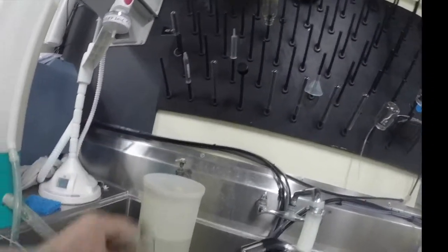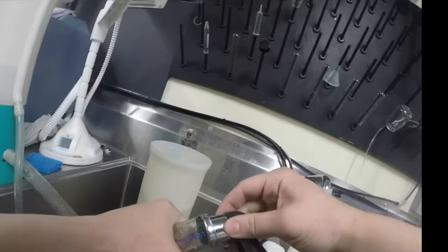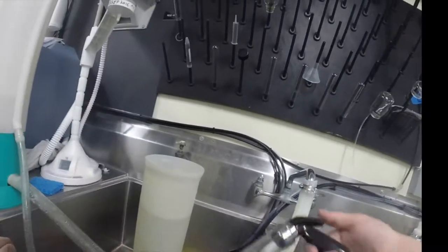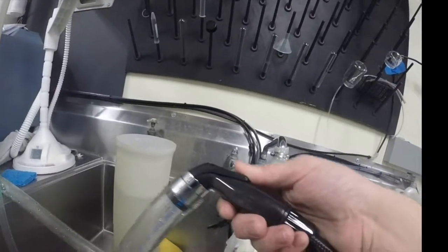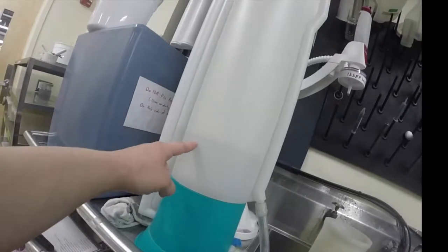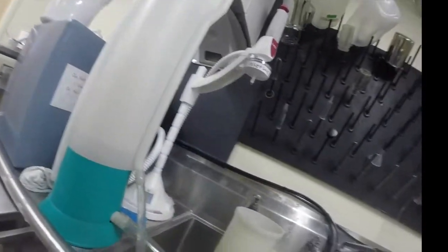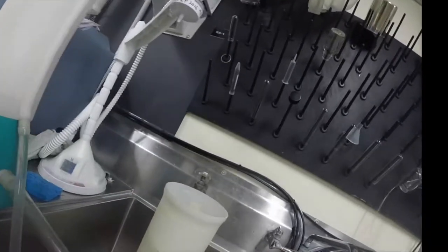So what I'm going to do, as it turns out, this guy fits pretty snugly to this. So if I just put it on there pretty snug and just apply pressure to it, the same thing is going to happen, right? We're going to be rinsing it through. Obviously there's a little bit of the sink water, so it'll be a little bit diluting it. So I'm going to disconnect it for this purpose. I've shown you how to rinse it with the two different waters.